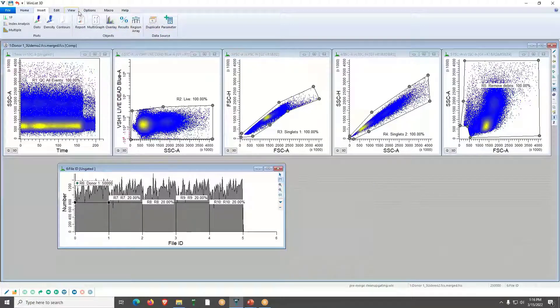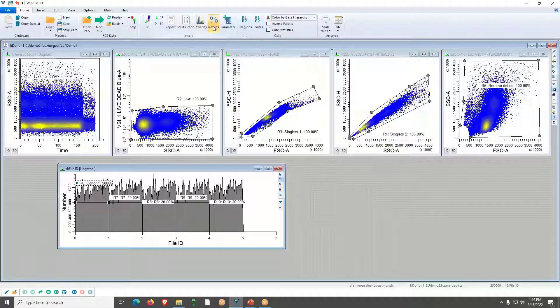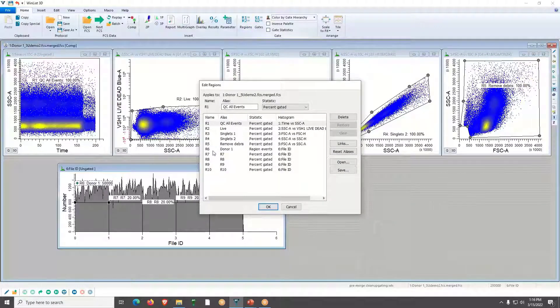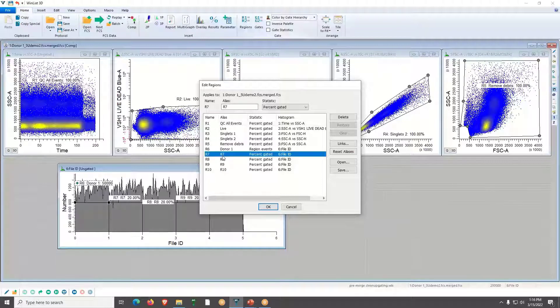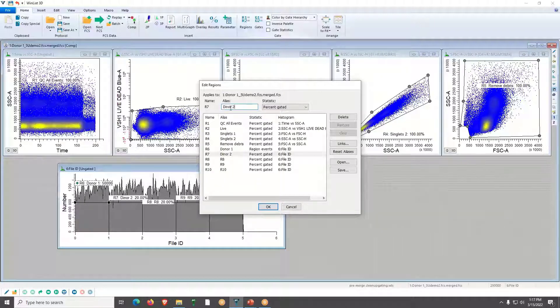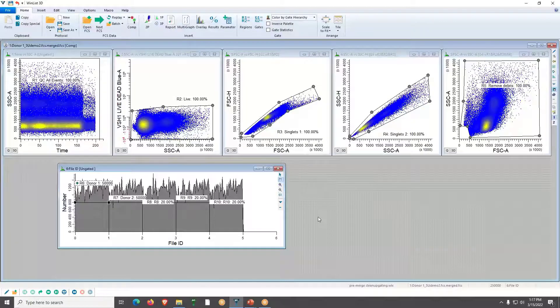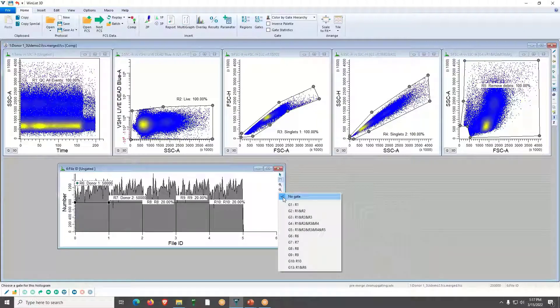From the Home menu, click on the Edit Region List box to edit labels from that menu. You can see R6 is already done. Highlighting R7, type 'Donor 2', select Region Events. You can do that for each one and click OK to save time. Once you click on those regions, each one becomes a gate that you can gate on.